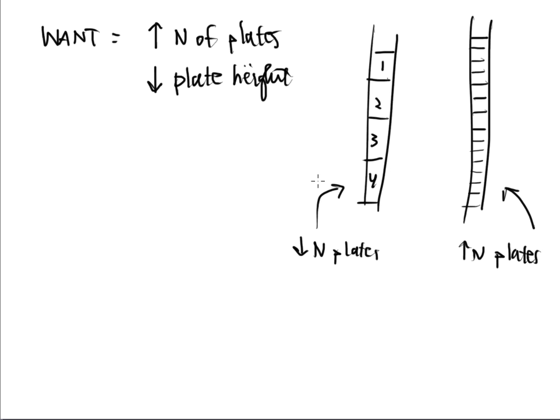If I relate that to the height of the column or the plate itself, there's the height. I'm going to abbreviate that with an H. Well, the height here is very large. It's a big number. They're tall, right? I'm filling up the same amount of space in each column. This height is going to be a little bit taller because there's only 4 of them. Well, same amount of space here. There's more plates in the same given area. So that means that my height is going to be a little bit smaller. It's not as tall. So this height is going to be very, very low.